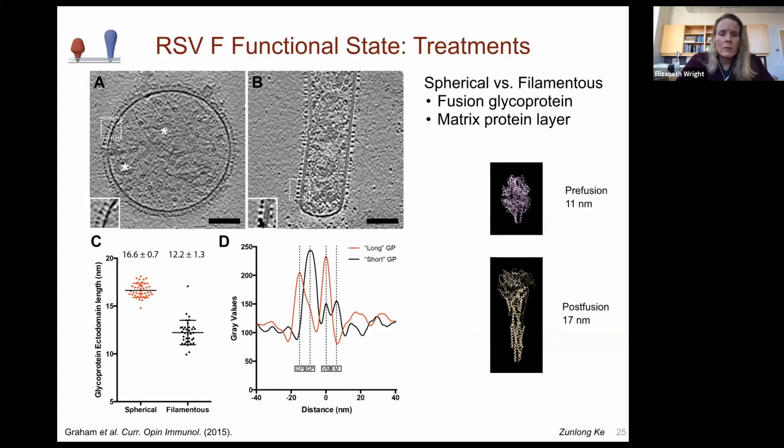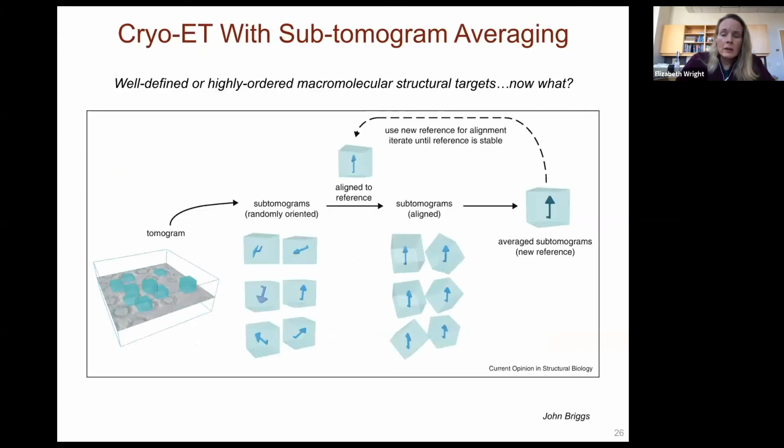And so we did a number of measurements to assess the ratio of F in the pre or post-fusion, i.e. triggered conformational state on these virus particles to confidently assess their structure. But then we could apply that to the virus particles that we were most interested in, i.e. the vaccine candidate, to validate which structural state that glycoprotein is in.